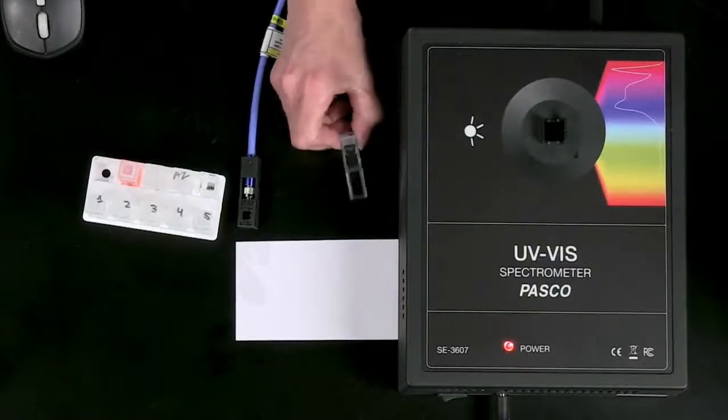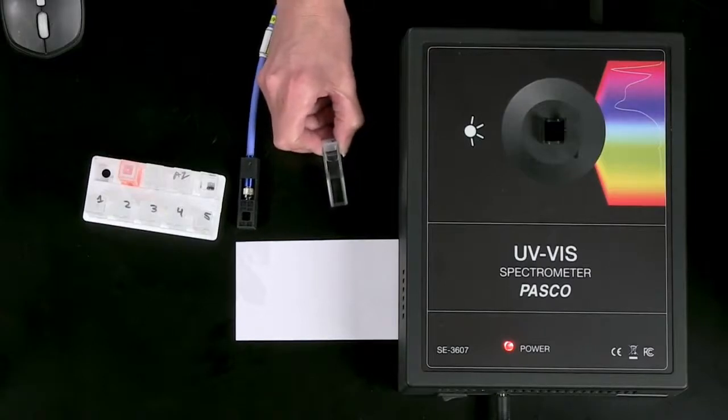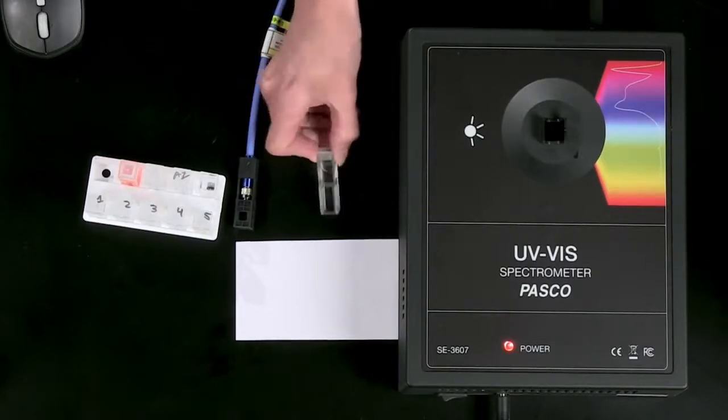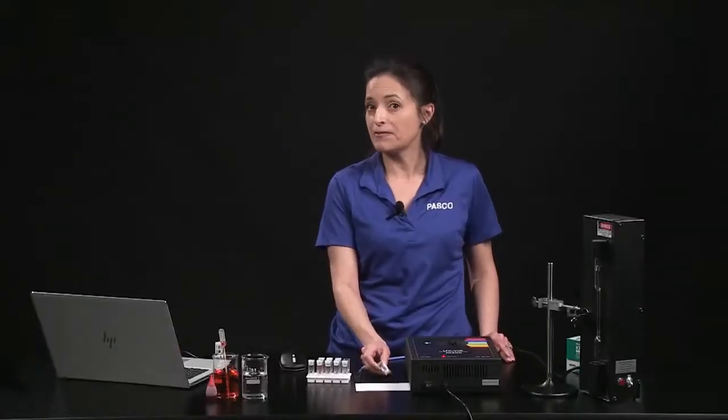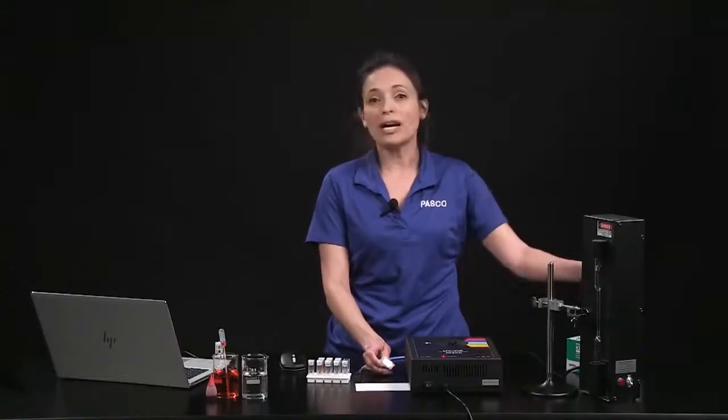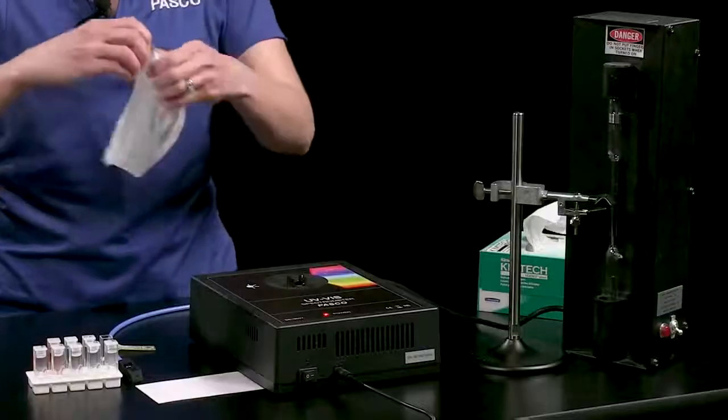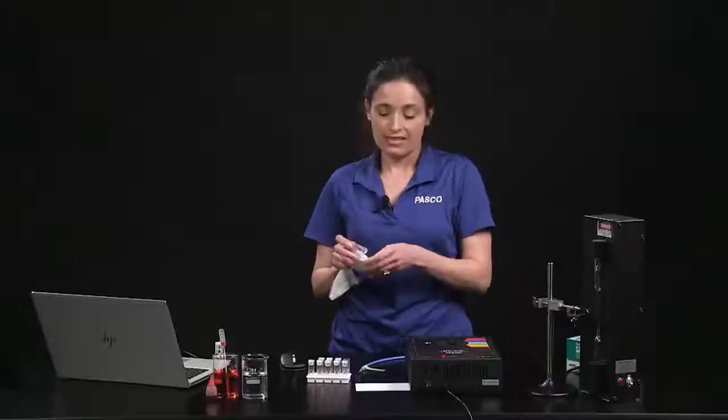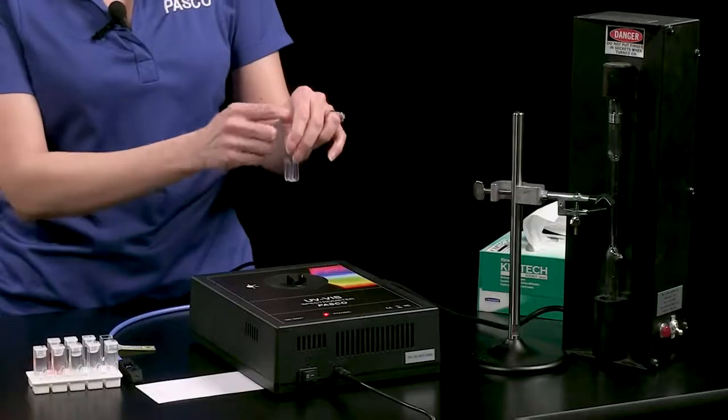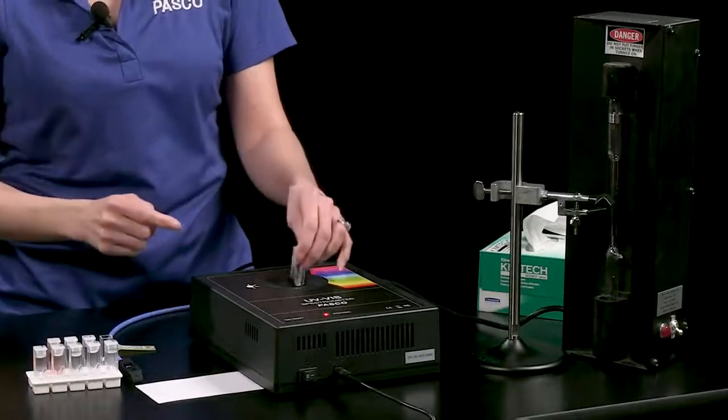Fill cuvettes about three-fourths full. The included cuvettes have frosted and clear sides. Handle the cuvette by the frosted sides to keep the clear sides clean and free of fingerprints. Wipe cuvettes with the lint-free lens wipe as needed. Position the cuvette so light travels through the clear sides and reaches the detector.